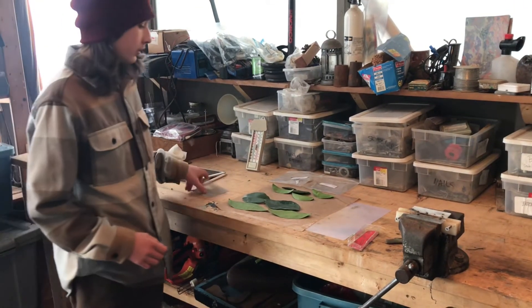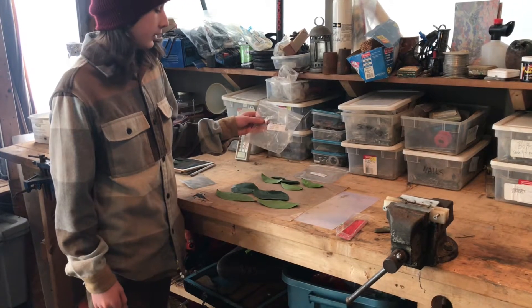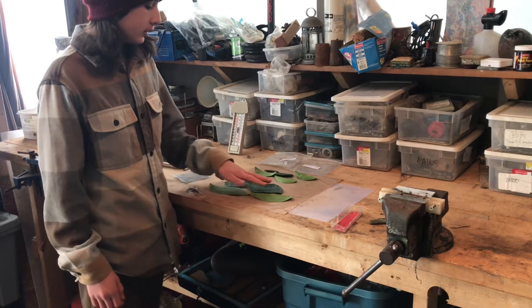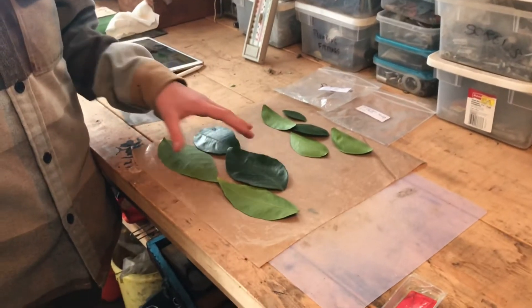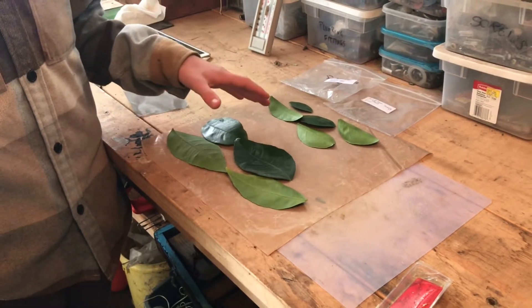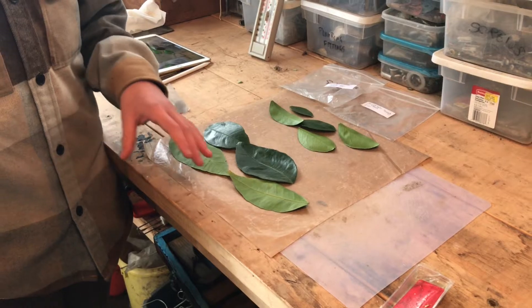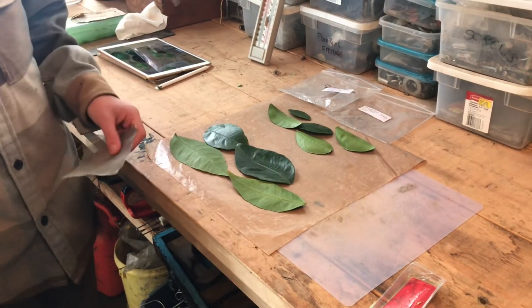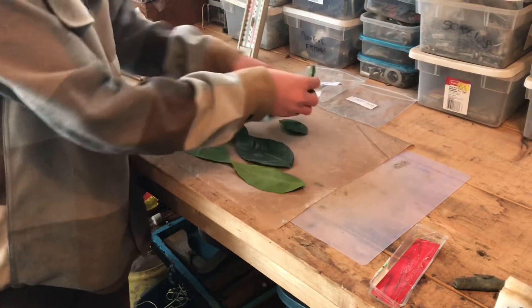So you start off and you collect your leaves and then you pop them in these bags. Then after you set them up nicely — young and old — you take a photo, label the date and what kind of citrus leaf they are. This is a Robertson navel, and then you just go young and old in like markup or something.